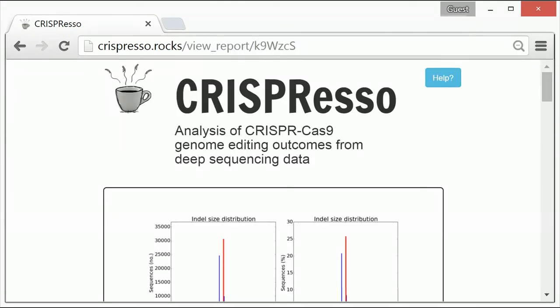Once CRISPResso has finished processing the data, you will see figures generated based on the analysis. Below each figure includes a description of the data presented in that figure.